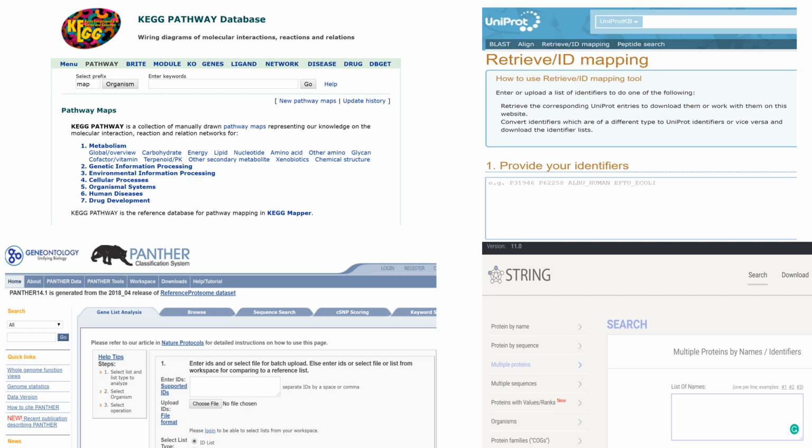So from the information I got from the UniProt database, where I can see which proteins are involved in this pathway, now I can analyze that pathway in the KEGG pathway database, and then I opted to find out what that pathway means. This is important because when the cell is under certain stressful conditions, it will activate certain pathways, certain metabolic processes, compared to the normal condition. By analyzing those pathways, we can infer what was done to the treated samples, which was our goal in the first place.